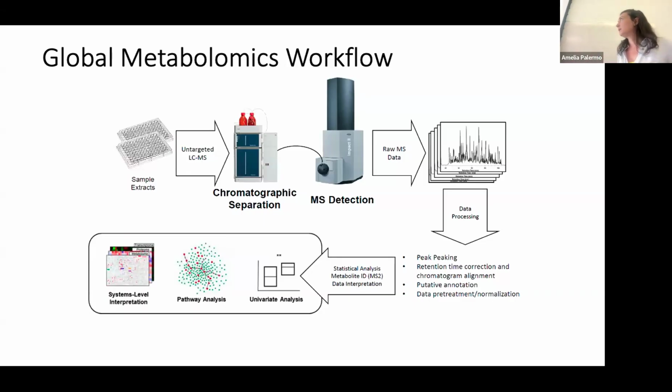And that is relevant because that is causing a phenomenon which is called ion suppression. Meaning that the more you inject in the ionization source of the mass spec at the same time, the fewer molecules will be ionized per type of molecule.